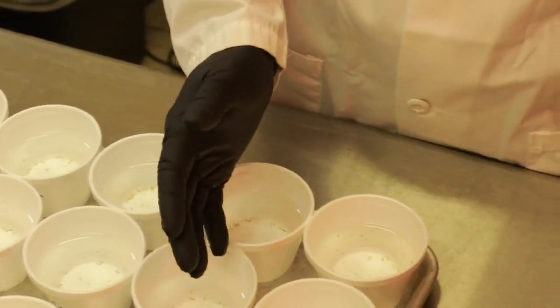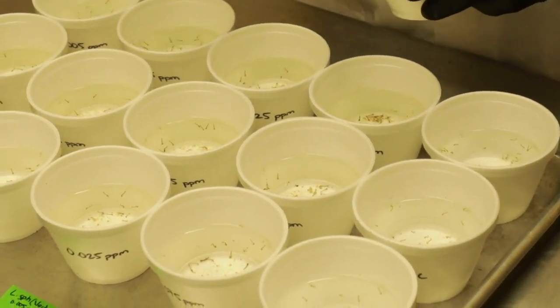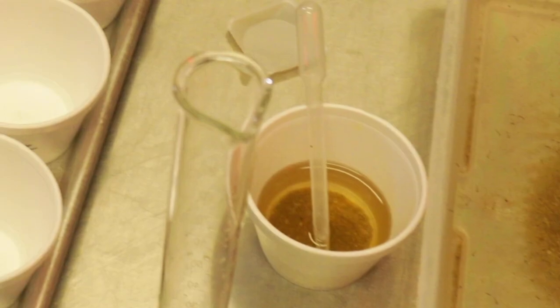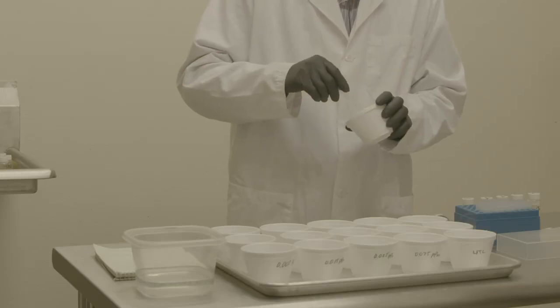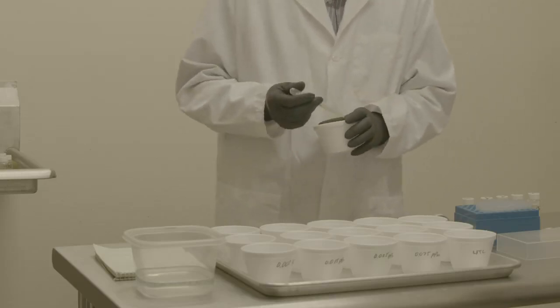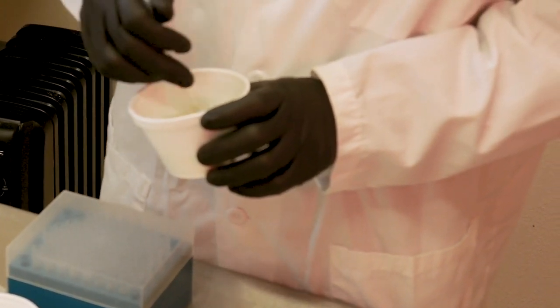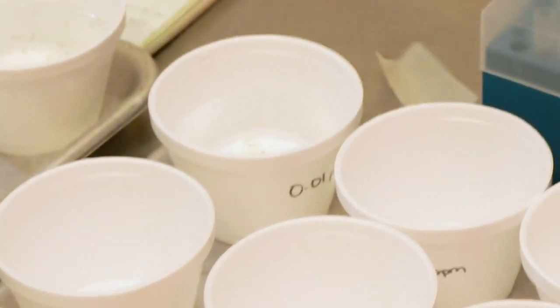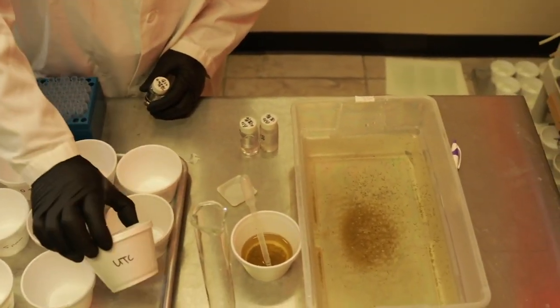For short-term bioassays of 24 hours in length, it is preferable not to add food, but if you do add food, then a couple drops of a 10% rabbit pellet solution can serve as a phagostimulant and avoid starvation of larvae, but not cause water quality issues. For 48-hour bioassays, larvae could be well fed for 24 hours before placing larvae in the bioassay cups, and then fed on the morning of the second day of the tests. For tests of juvenile hormone mimics, a small amount of solid food, such as 100 milligrams of rabbit pellets per bioassay cup, is suggested to provide nutrients till pupation.